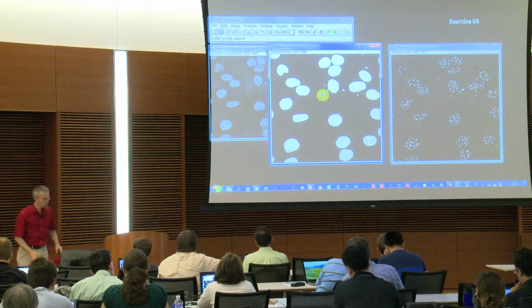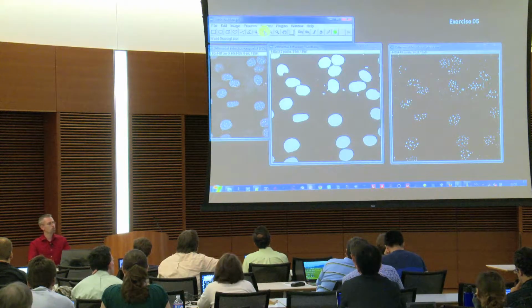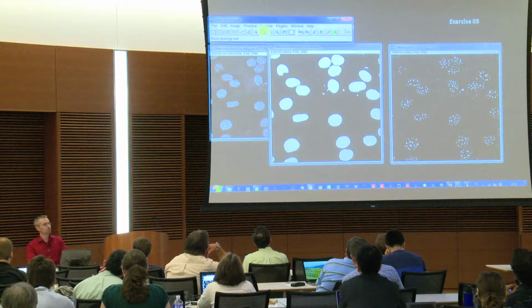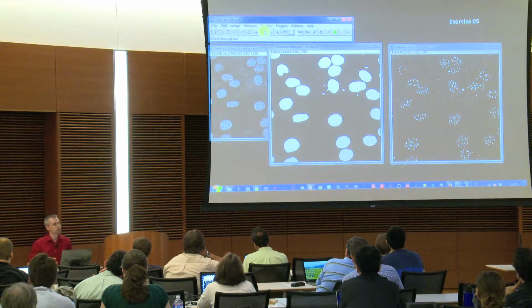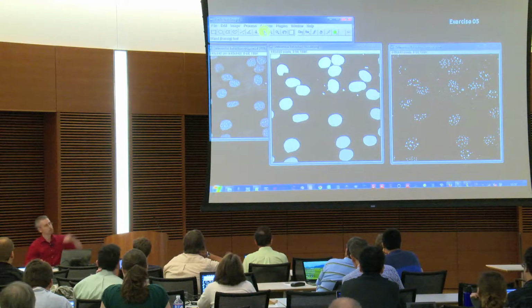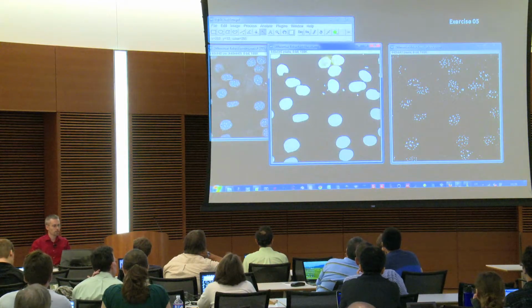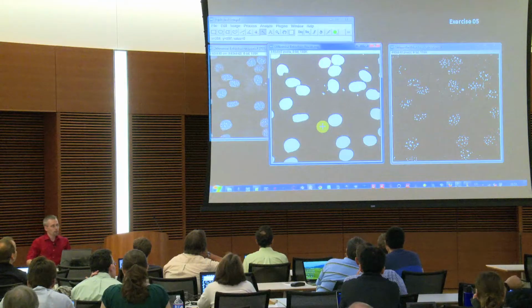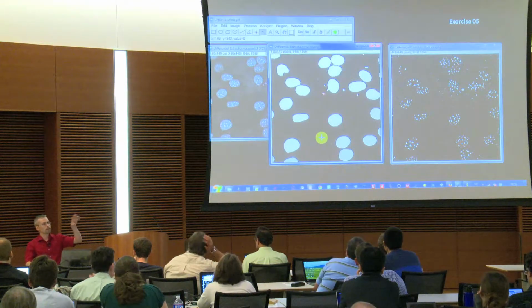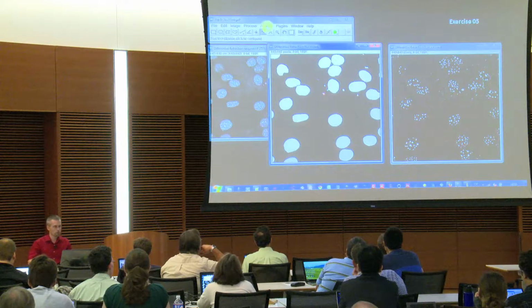Just quickly, how you could do that: there is this nice wand tool, and this wand tool selects, when you click in the image, all pixels of the same intensity. So if you click on a white pixel, it selects all the others which are surrounding it and have the same intensity, which here is white. So this means if I select the wand and click inside, I'll get these features. So if I click now in my small objects, which I want to get an eye on, how big are they approximately, and then I simply start the measurement.